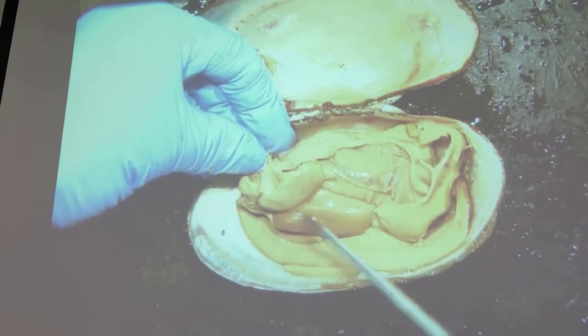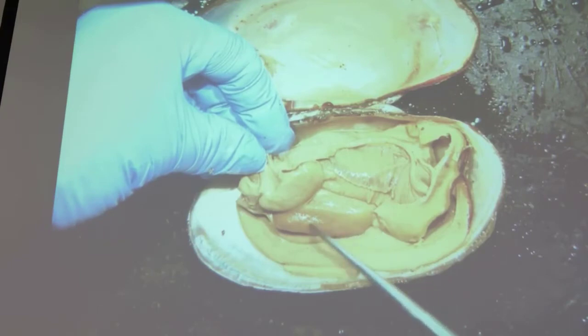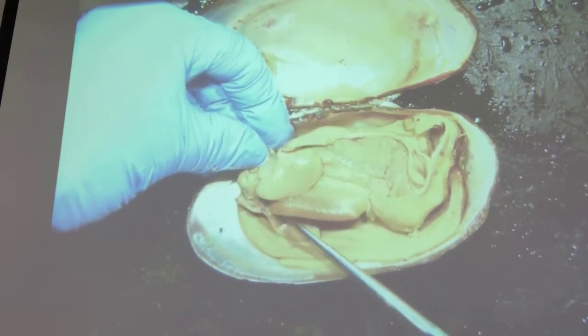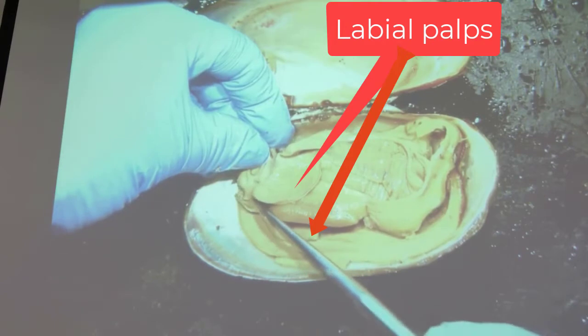This is a very tough muscle. You can see a little bit of variation in the texture and color of the structures here. So this part here is the muscular foot. What you're seeing here are the labial palps. So there's a pair of labial palps. Here's the other side, on either side of the mouth.